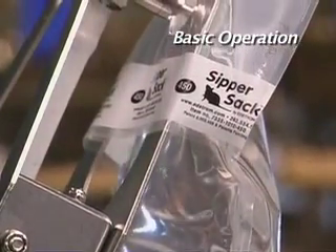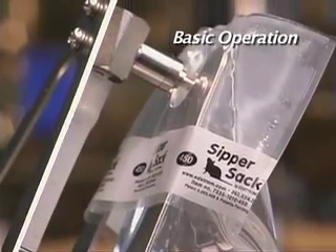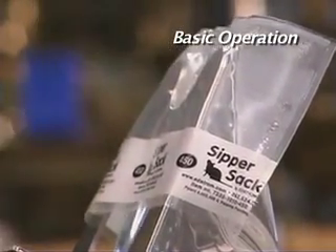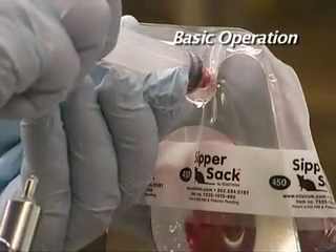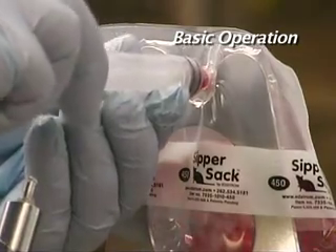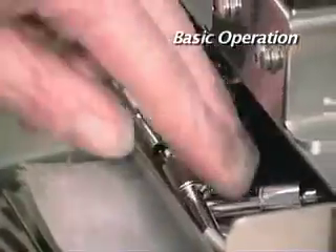When the Sippersack has reached its capacity, the filler will automatically shut off and the filler head can be disengaged. If water soluble compounds need to be injected, this can be done directly through the fill port on the Sippersack before inserting the drinking valve.